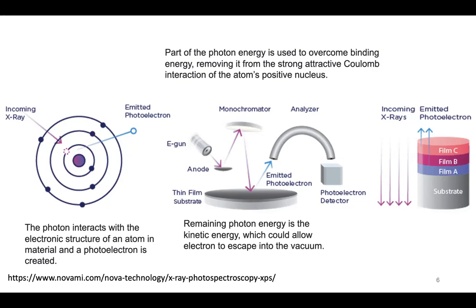And that amount of energy, 1,000 to 2,000 eV, allows you to excite a lot of core electrons and also electron energies that are above the core electrons. So you can already tell that, if you're operating at about incoming 2,000 eV, you're not really able to access higher energies than that.